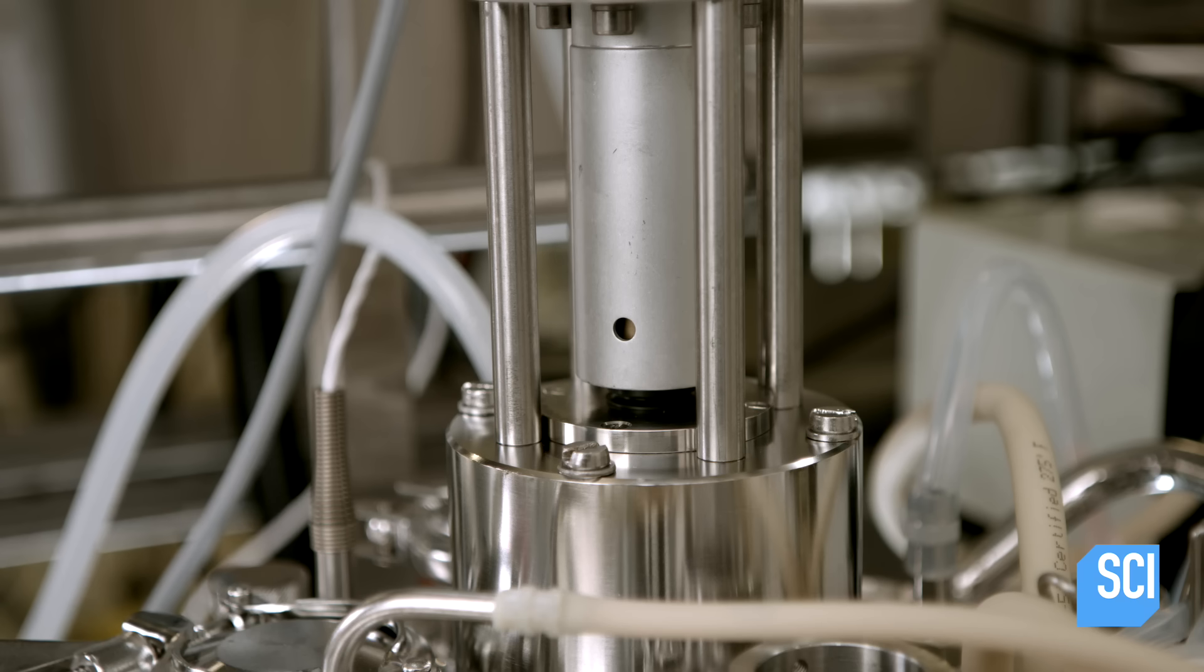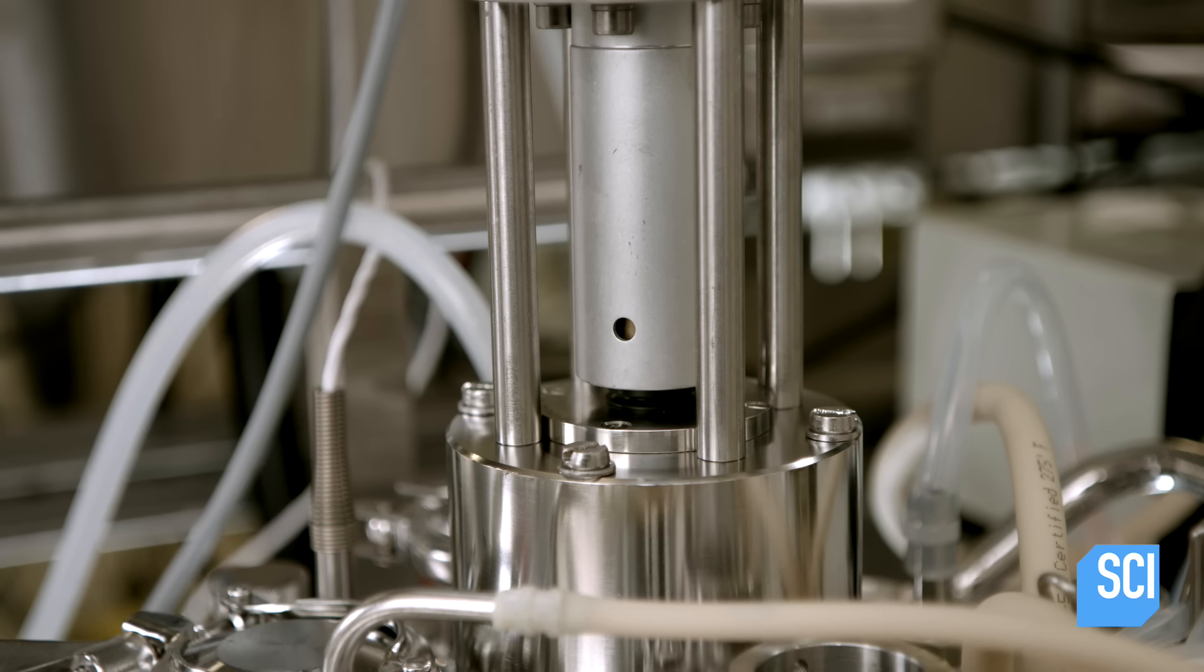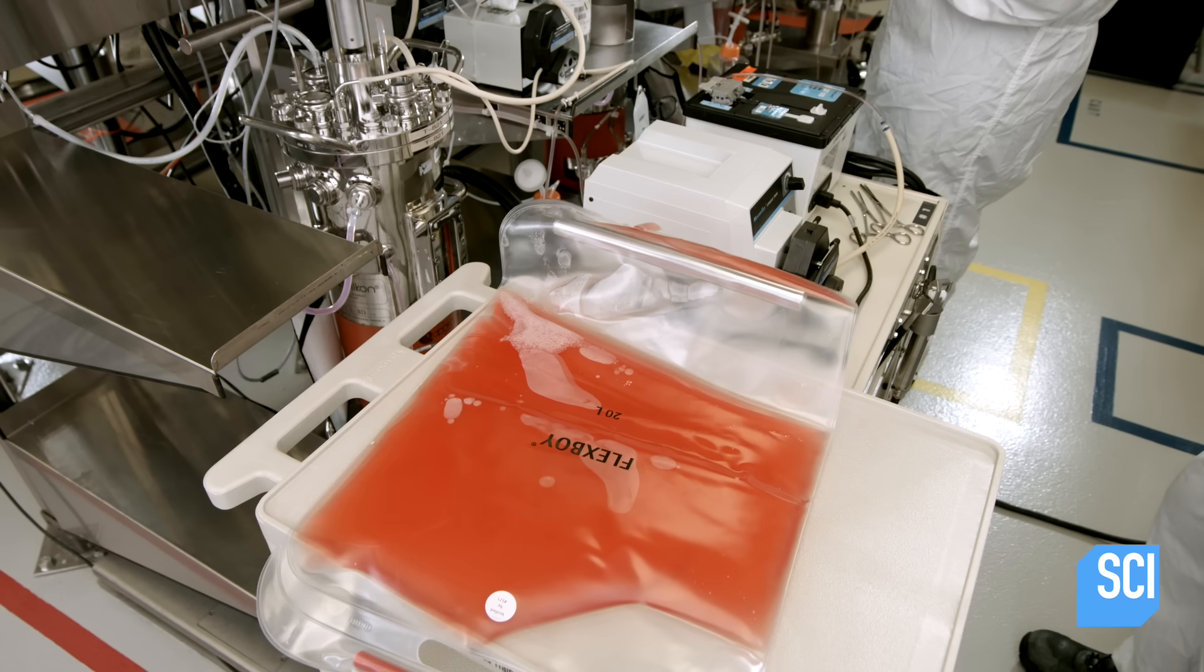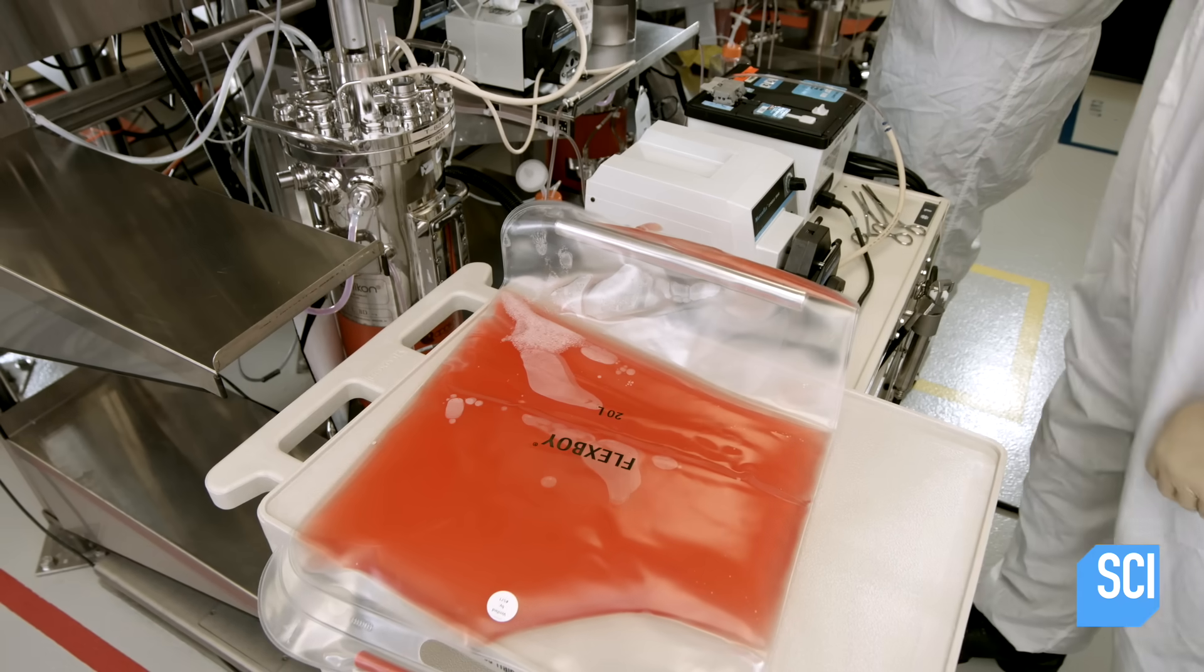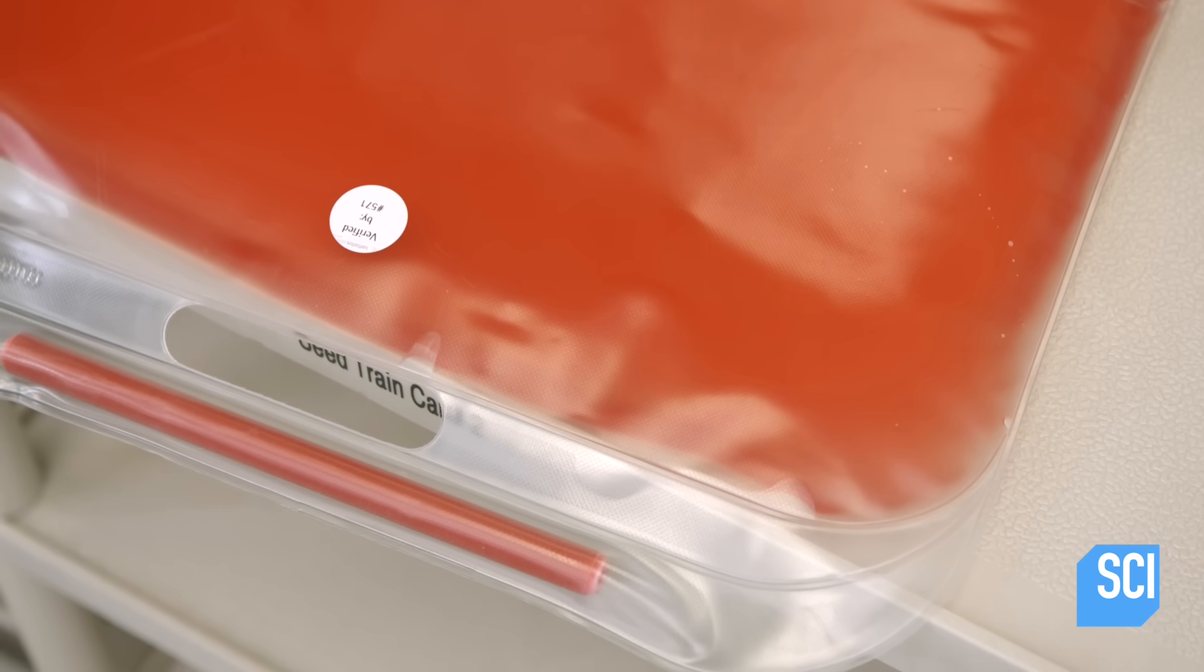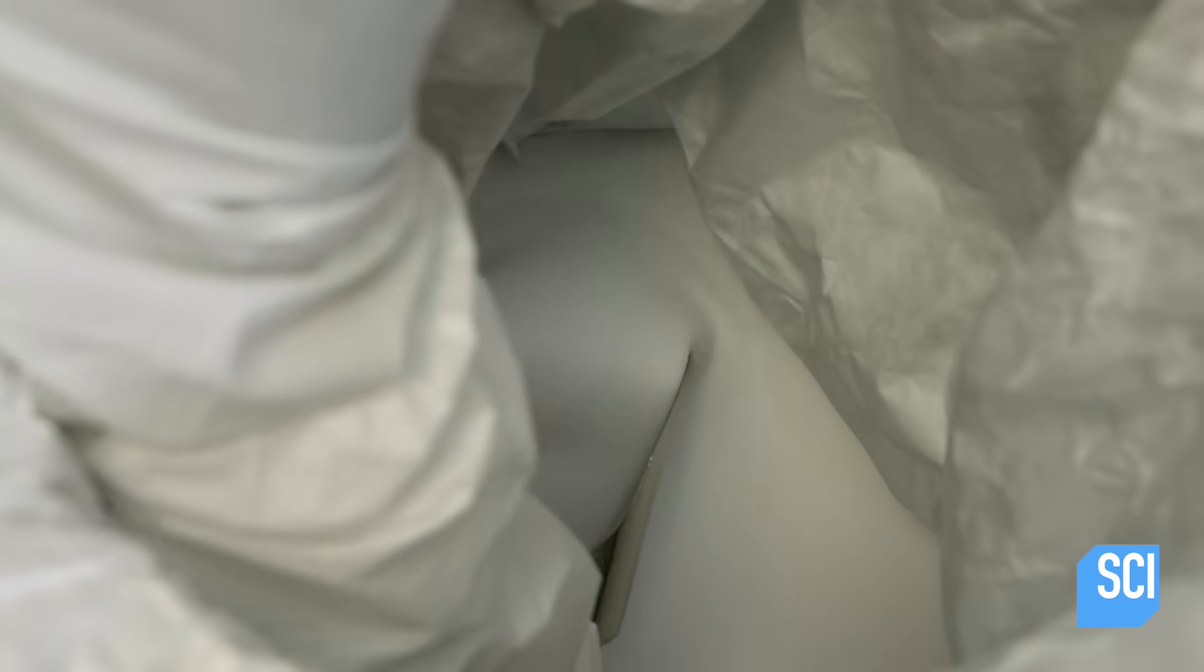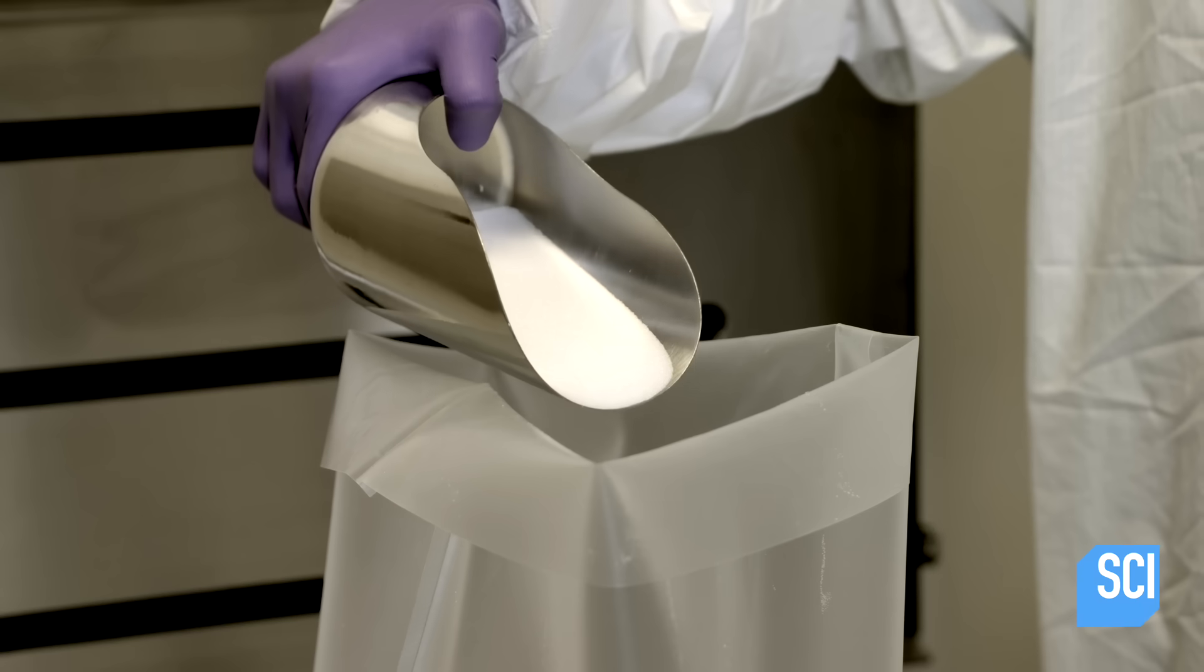Inside, a propeller agitates the mixture to stimulate growth. Over a three-week period, the number of cells increases exponentially. Each new cell is programmed to produce the target biologic protein. Next, a technician measures salts and other dry ingredients. He's preparing a recipe for purifying the protein liquid once it's been separated from the cells.